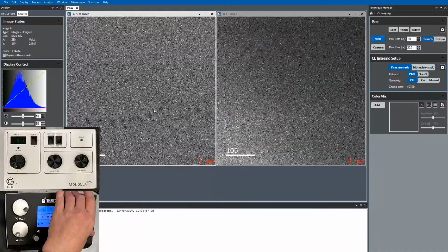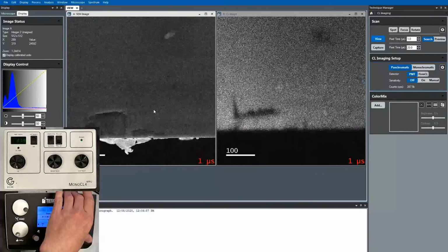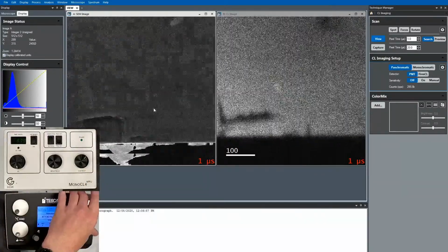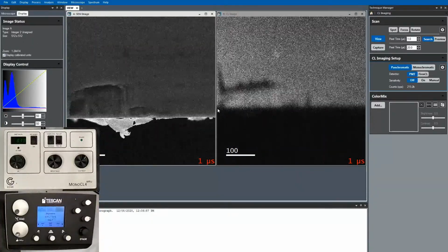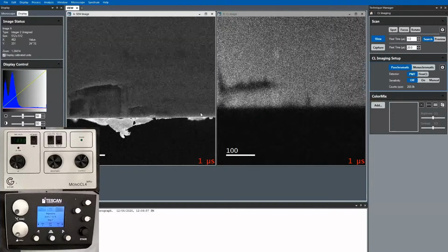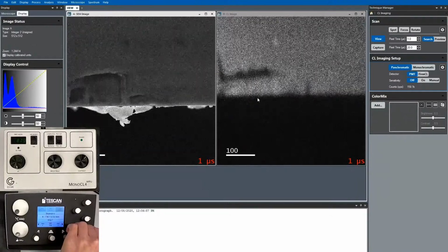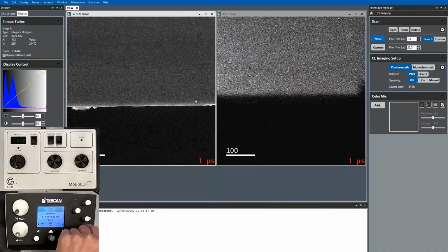And we know that we're interested in the edge of the sample. So let's get there. So what's actually interesting here is you can see there's a difference in this interface. So your layer, whatever your layer is, to be honest, I don't know much about your material. This is much less cathodoluminescent, if cathodoluminescent at all.